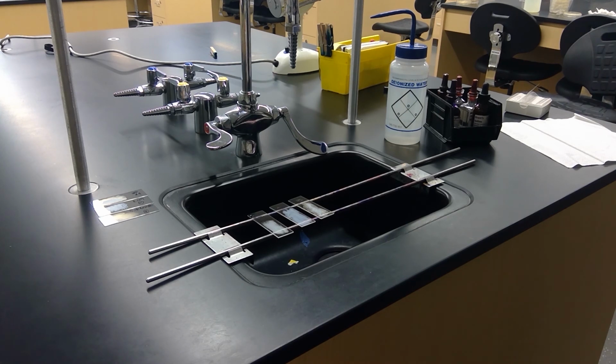3, place your smears on the staining rack over a sink. Do not leave clothespins on your slides. 4, carefully add crystal violet to cover the smear and let it stand for 1 minute.